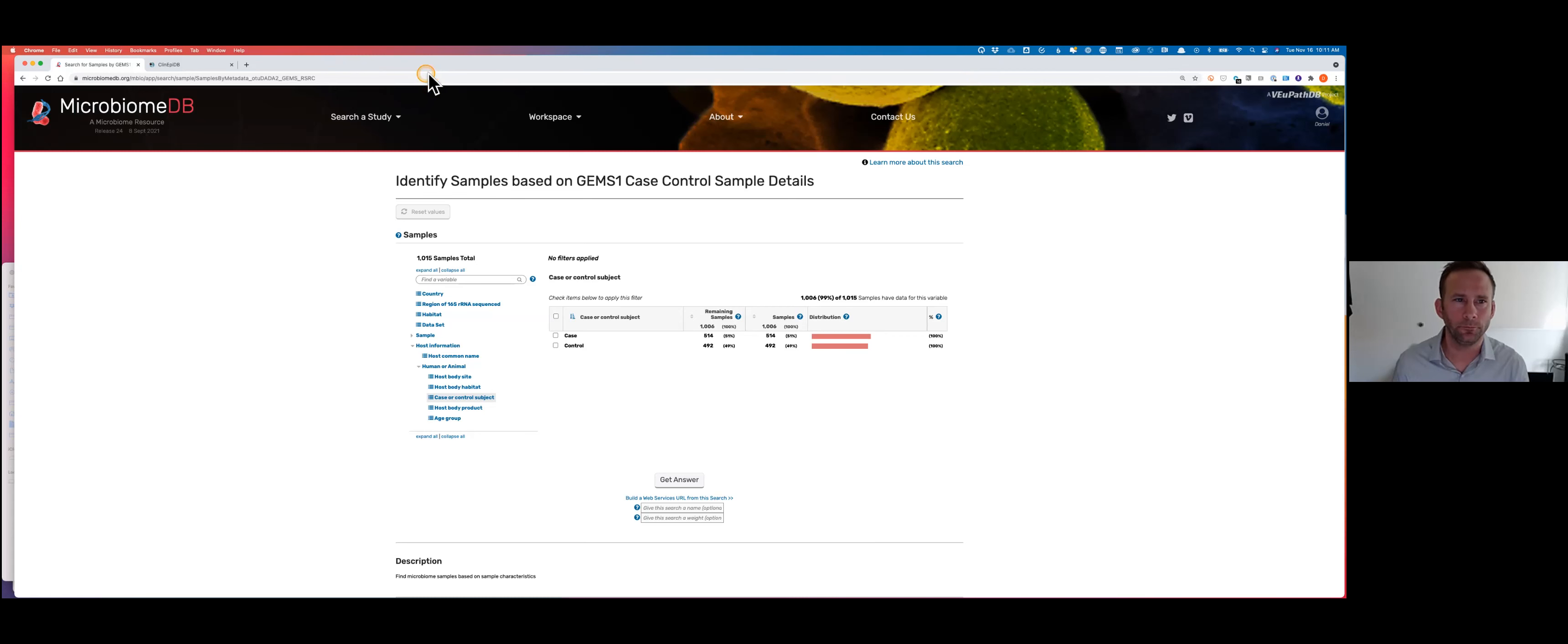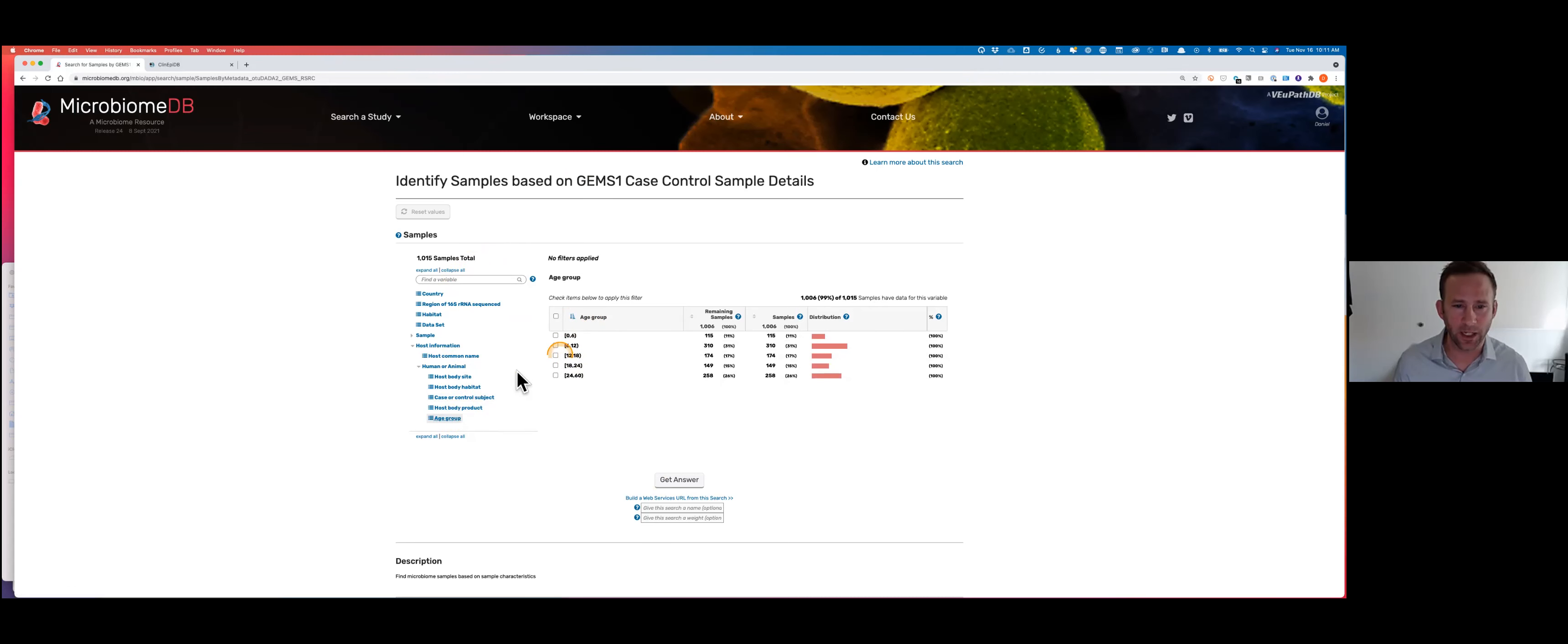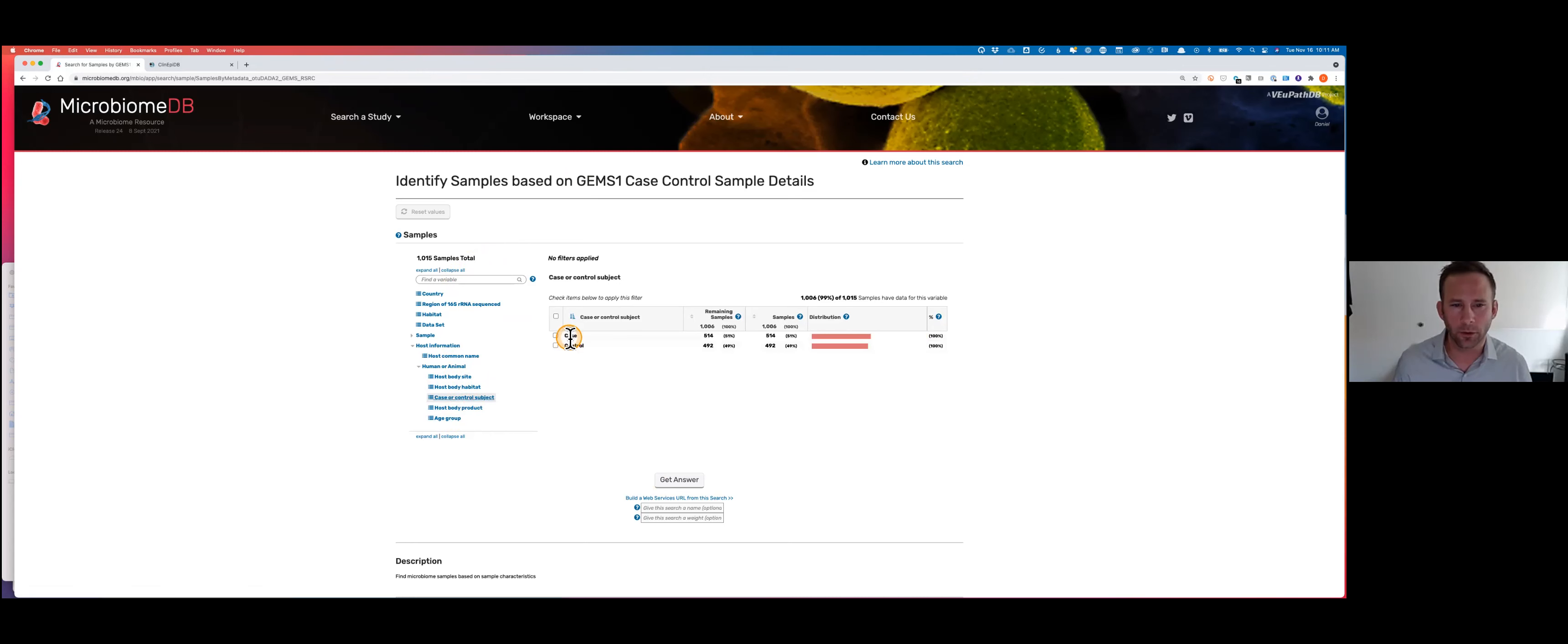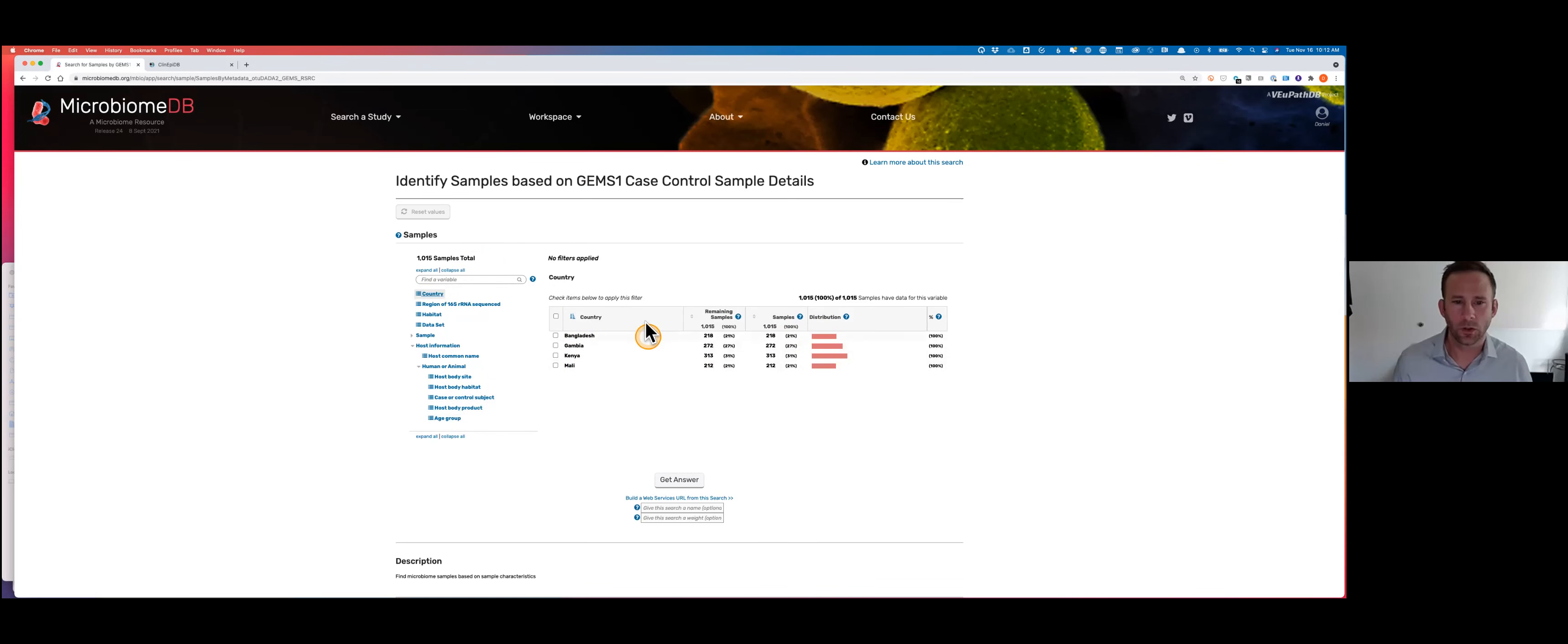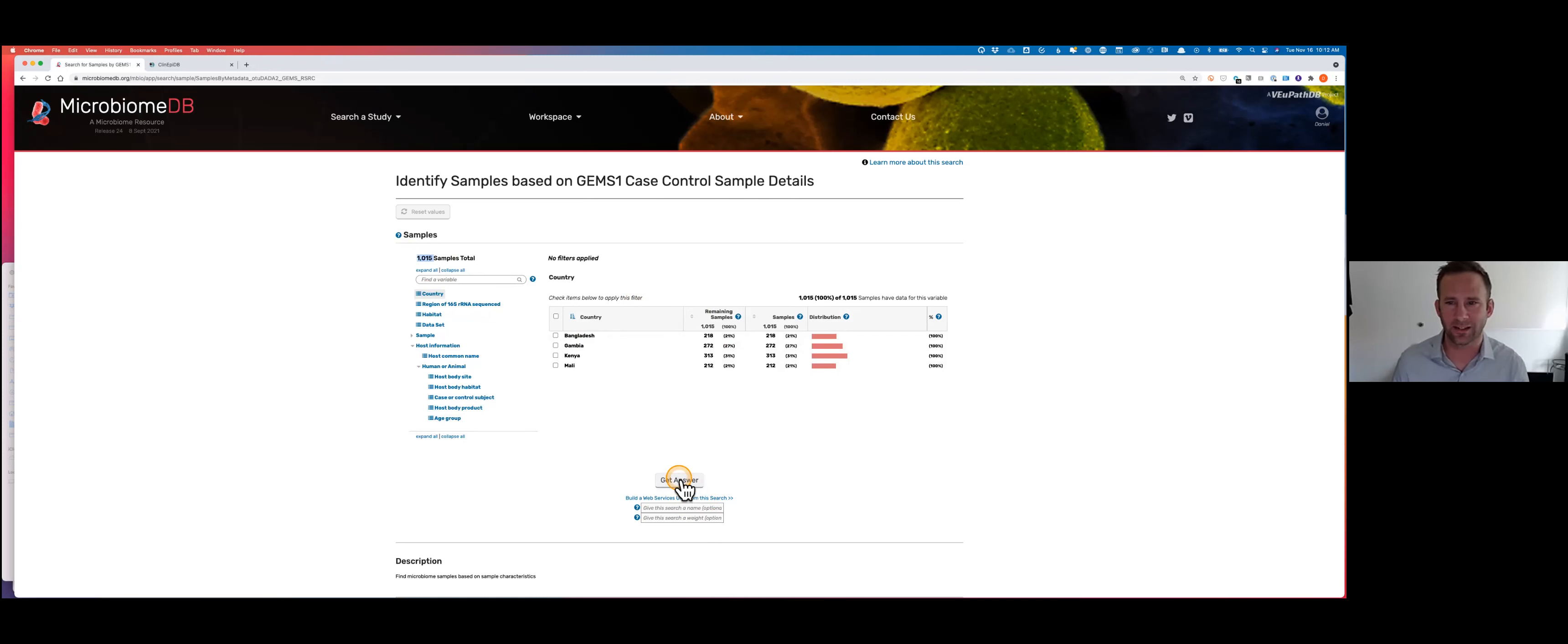What that means is we have pretty sparse metadata represented on MicrobiomeDB for the exact same participants that you would see on ClinEpi where there's far more metadata. One of the things that's going to happen moving forward is we're going to be able to draw on that much larger universe of clinical metadata and epidemiological data from ClinEpi and pull it into MicrobiomeDB. They collected information about the age group, the host body habitat which was stool or colon samples, whether the sample came from a case or control, and which country they came from. The first thing I'm going to do is not filter the data at all - I'm going to take all approximately 1,015 samples and move those forward to the next step.